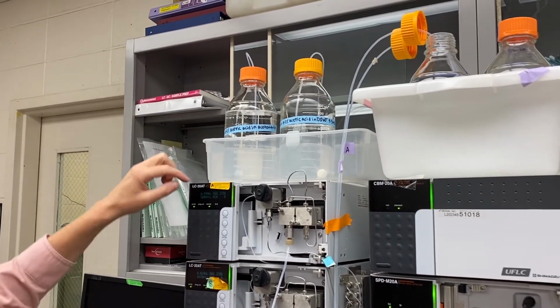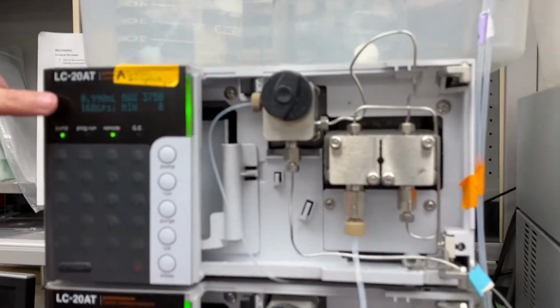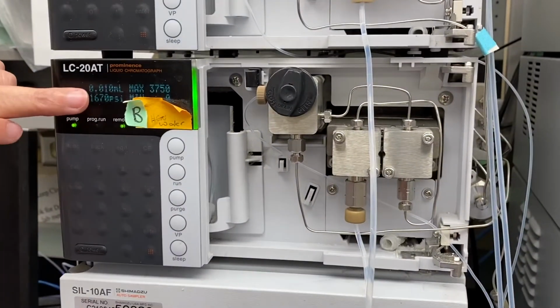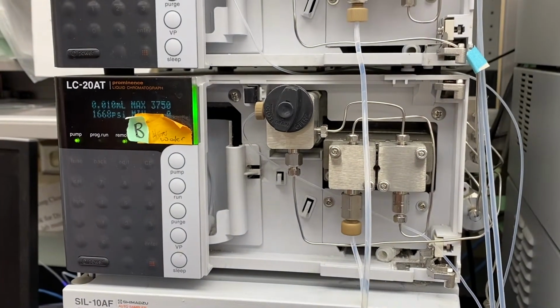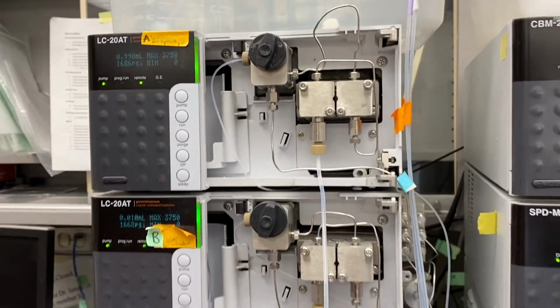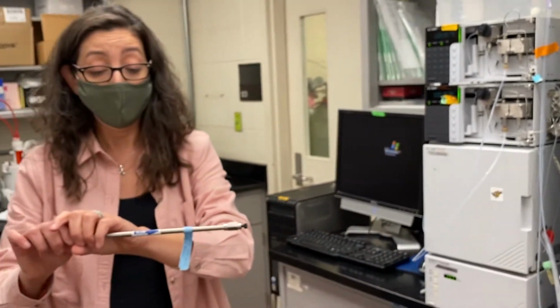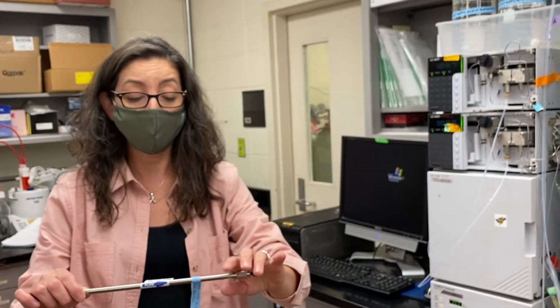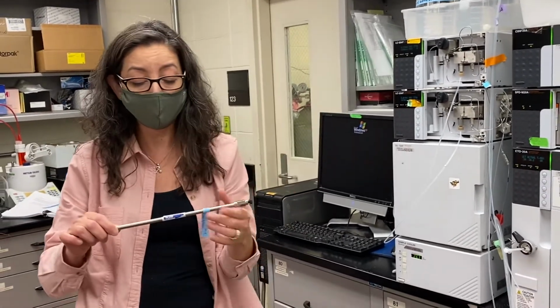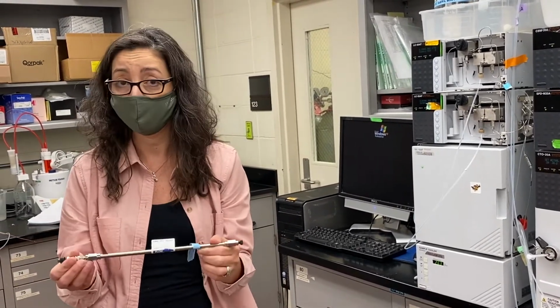So if we close up here, Allie, you will see that we're starting with 0.99 ml per minute water and 0.01 milliliters per minute acetonitrile. So that's 99% water to 1% acetonitrile. This makes the starting mobile phase polar. So if we have a non-polar stationary phase and a polar starting mobile phase, this makes this mode of chromatographic separation what?